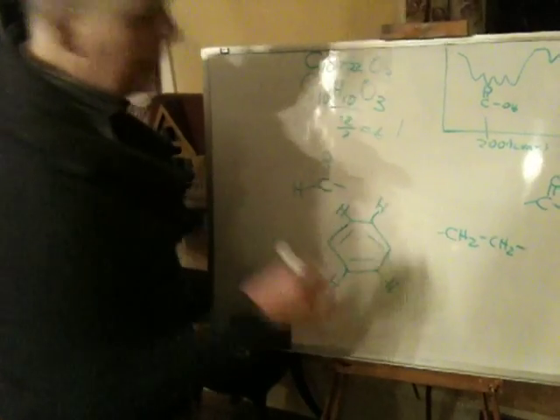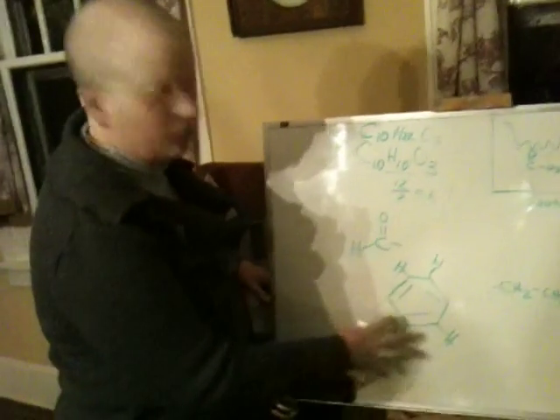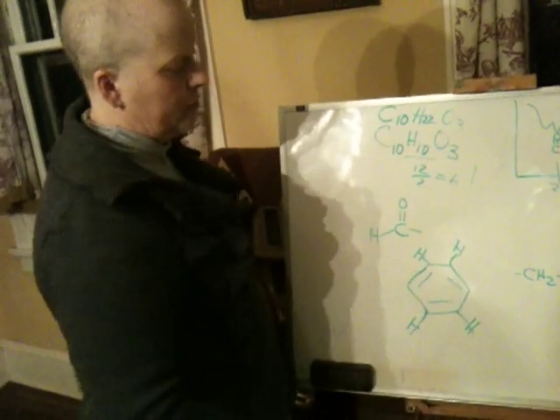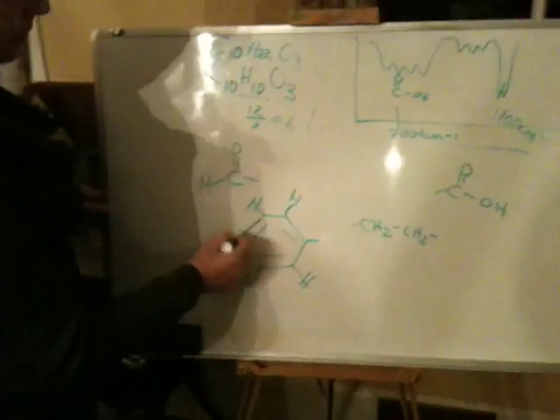Now, again, I encourage you to try other combinations of the hydrogens. In other words, cluster them all together, try different substitution patterns. I'll show you one at the end. But this is basically what we've got. This is what the NMR is saying.